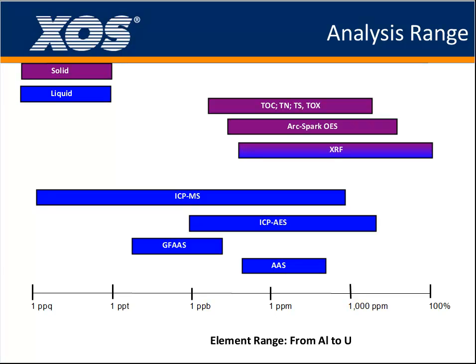And for the concentration range, XRF technology has a very wide dynamic range of analysis, from 0.1 ppm to 100%. It is a very large range. And for HDXRF, its advantage is in the low concentration part of XRF technology, and it can give better results for sub-ppm and ppm level concentrations of elements.